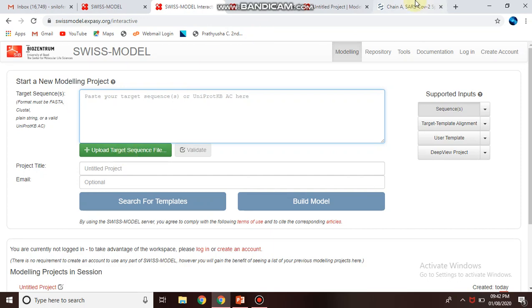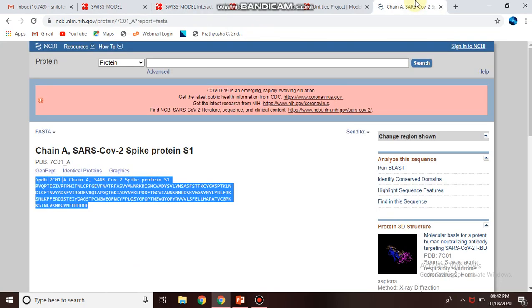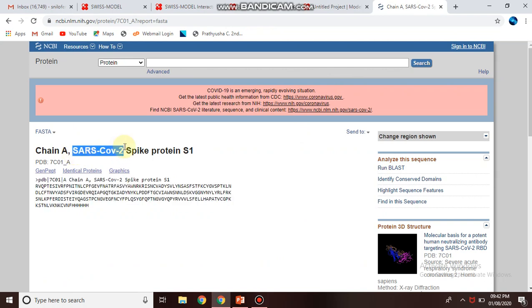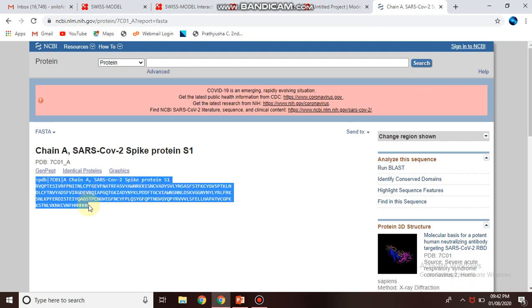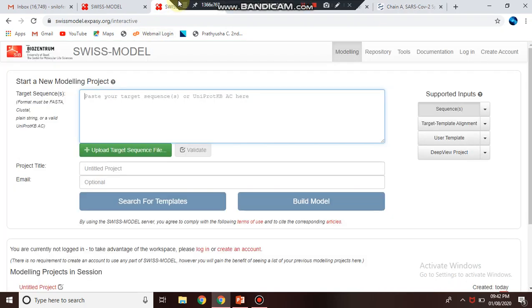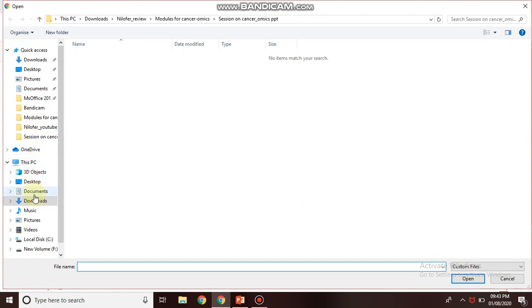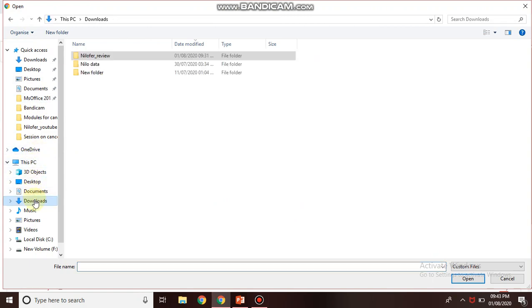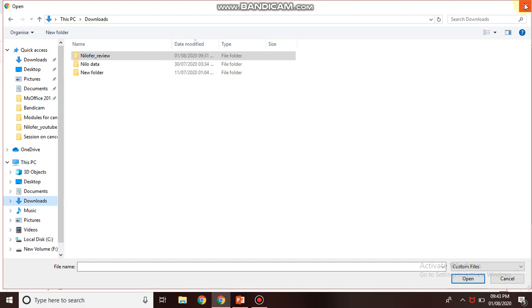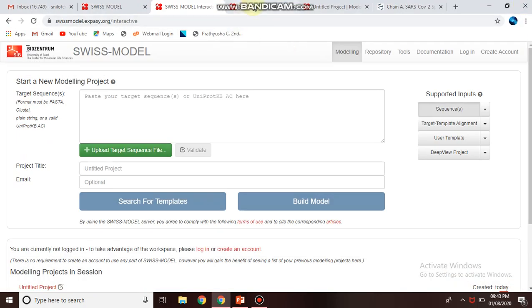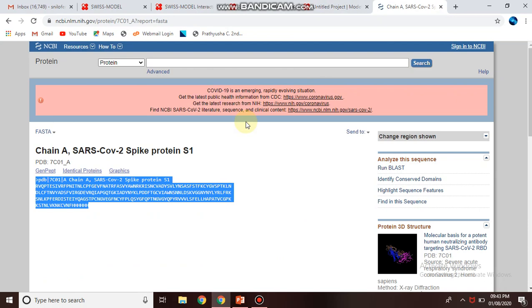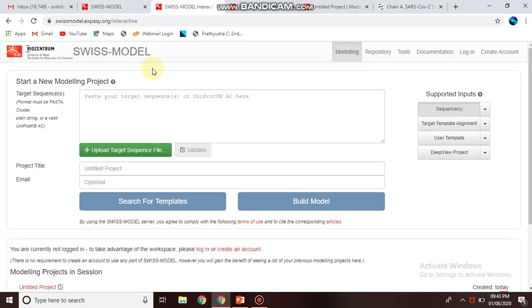I have chosen this target SARS-CoV-2 protein and downloaded this FASTA sequence. I will upload this structure sequence here, or you can directly copy-paste your structure.